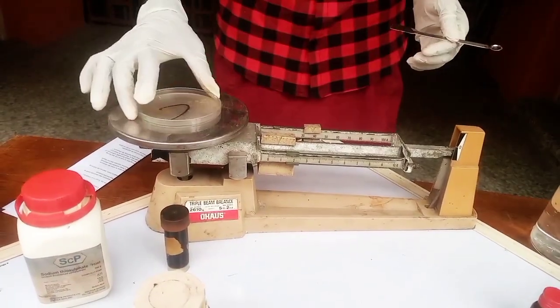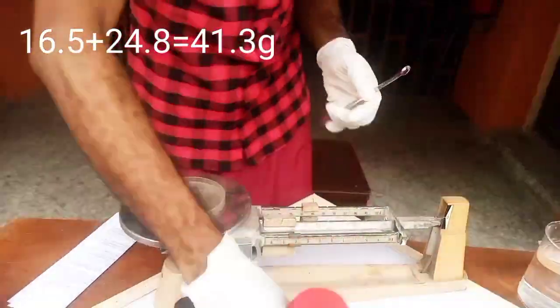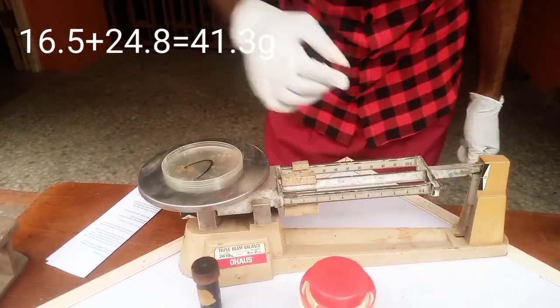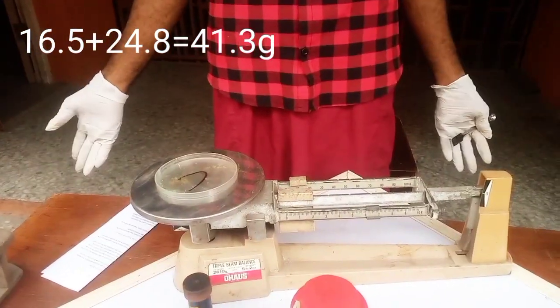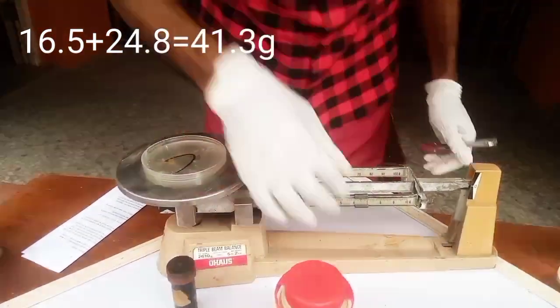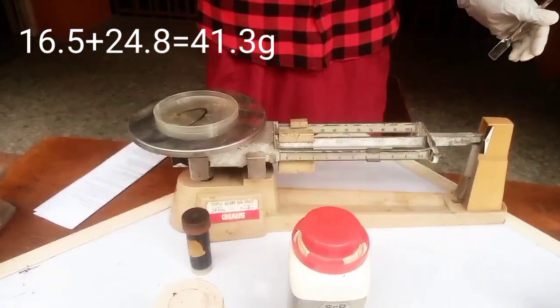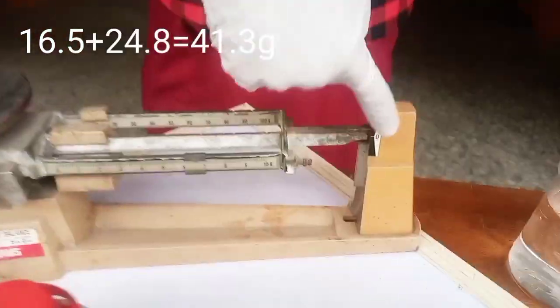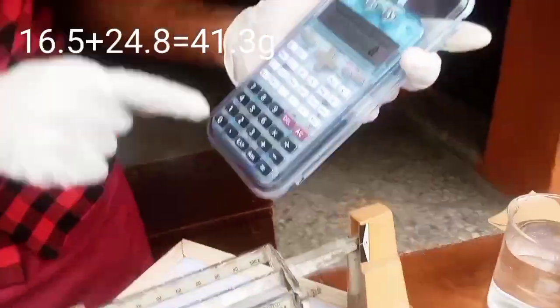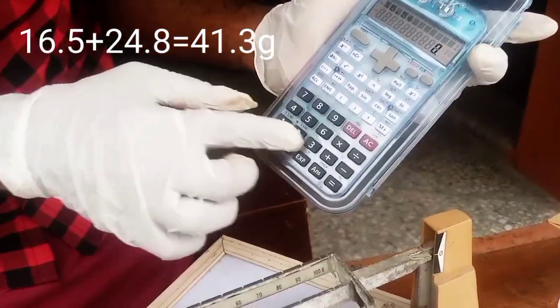I need to measure out the petri dish zero level and then add the sodium thiosulfate inside it. But before that, I need to bring that thing back to the zero level and measure it. And I found out that the value actually ended up being at that same 16.5 gram, that is the petri dish. And you know, we are trying to get the mass of the sodium thiosulfate, and the mass of the sodium thiosulfate added to the petri dish should be 16.5 plus 24.8, which is going to give us 41.3.